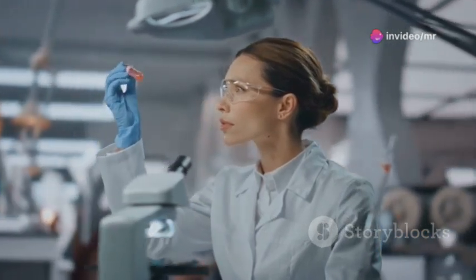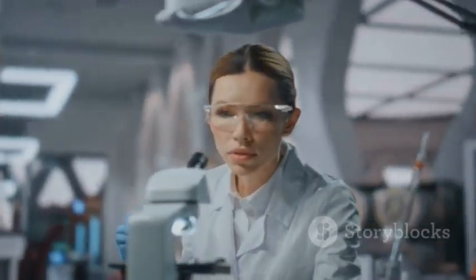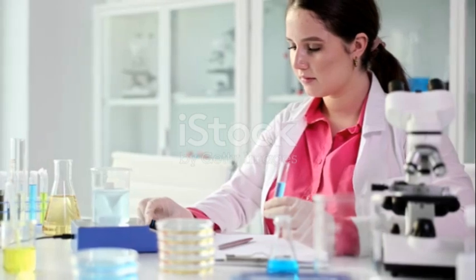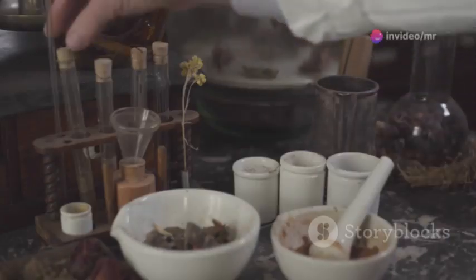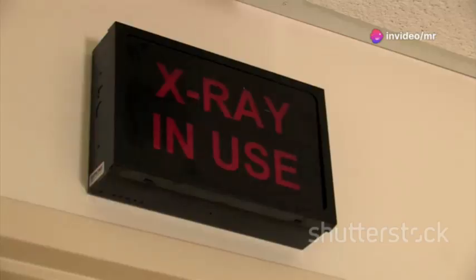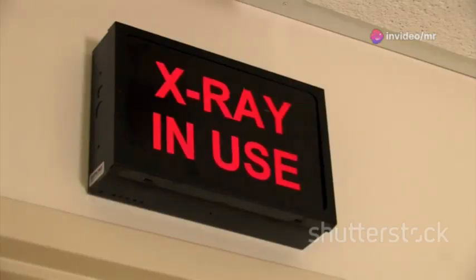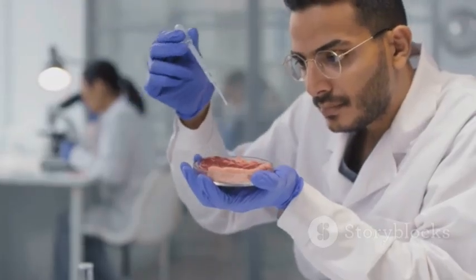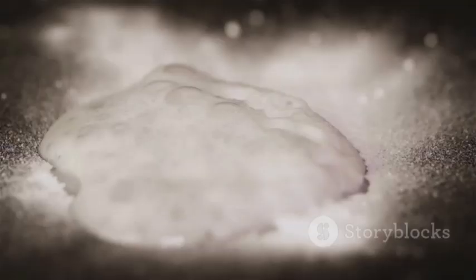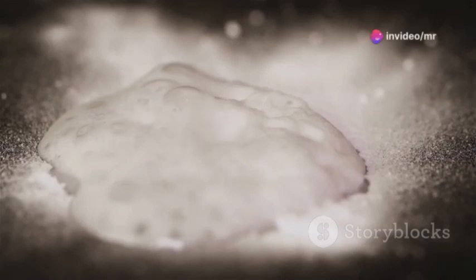Section 5. Prepping your sample, getting ready for the X-ray show. Before we can start our XRD experiment, we need to prepare our sample. We want our material to be in a fine powder form. This ensures that the X-rays can interact with as many crystals as possible. Think of it like this. If our material is a big chunk, the X-rays might only see the surface. But if it's a powder, the X-rays can see all the different angles and facets of the crystals.